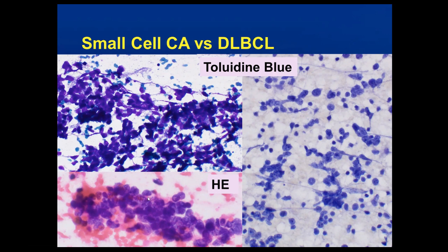and then the clinical team can decide if they want to start treatment or not, or wait for the stains. But these cases sometimes happen in the middle of the weekend, and not everywhere you have the availability of technicians that can come and do immunostains for you. So it is really important that you have this skill to be able to favor one or the other, because in a situation that you can't wait and they need to start treatment, at least it can be helpful.